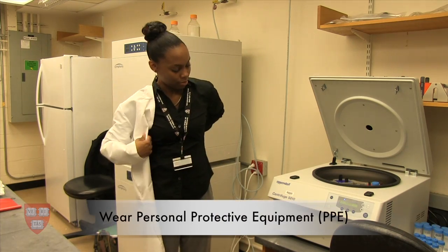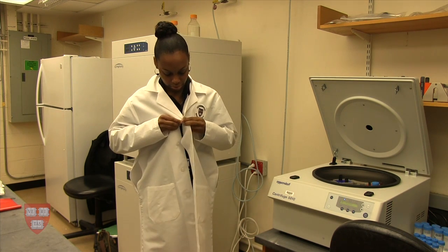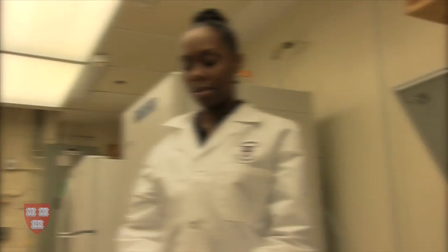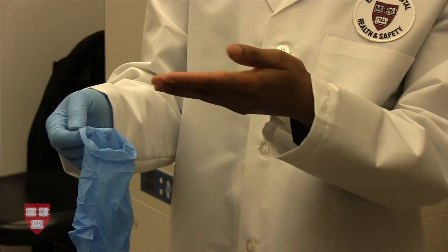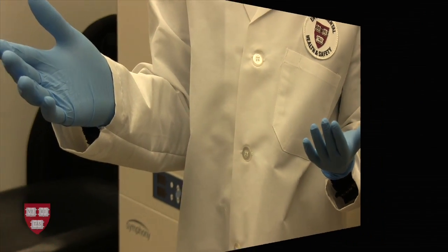Second, wear basic PPE when working in the biosafety cabinet. PPE not only protects the researcher, it can limit contamination from skin and clothes that can ruin an experiment. The level of PPE needed varies from lab to lab and from project to project. Be sure to check the PPE assessment before starting your work. Also, consult with environmental health and safety if you have any questions regarding your PPE.